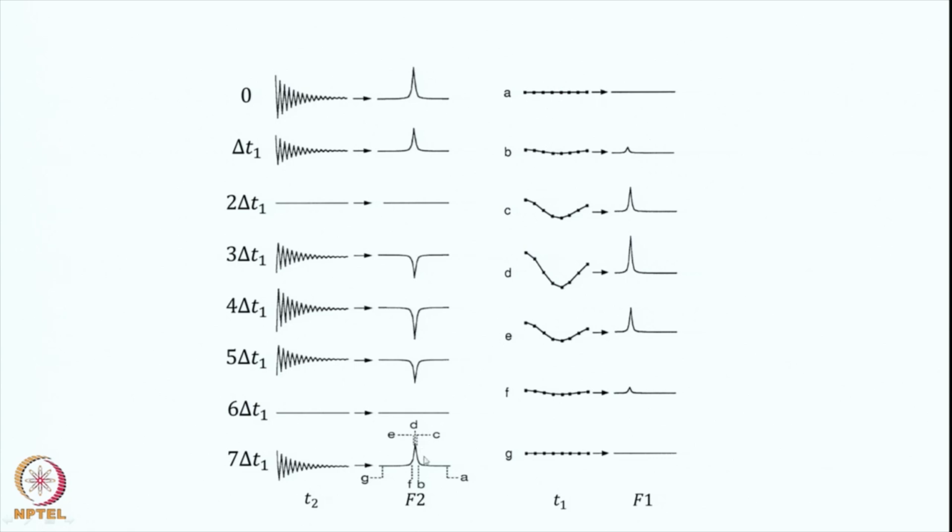After you have collected the signal and Fourier transformed it, by looking at these frequency points you generated a frequency dependent variation. So, this is a time variable which has a frequency component, it displays the frequency, and you Fourier transform here, therefore, you get a frequency component whatever is present here. So, in this particular case it is a single frequency, the same frequency which is present, and its intensity is getting modulated by the evolution during the time T1. So, these frequencies may be different, may be the same. Okay. So, here we have just shown, we have not indicated what this frequency is. It may be the same frequency, it can be a different frequency, it can be a combination of both.